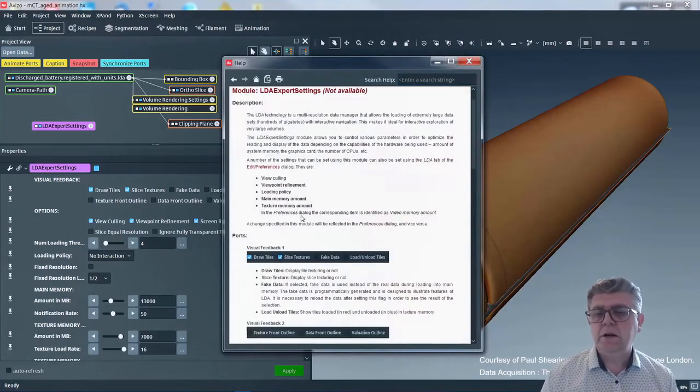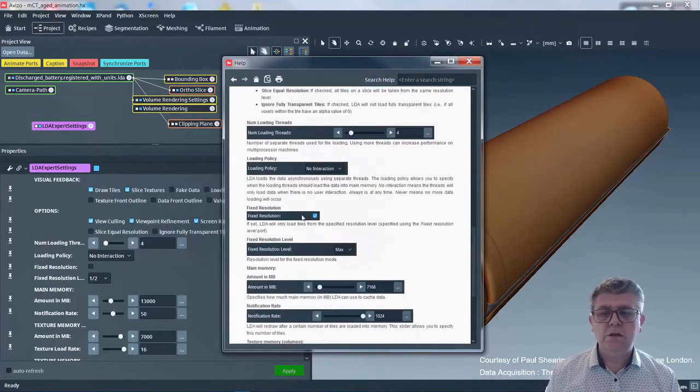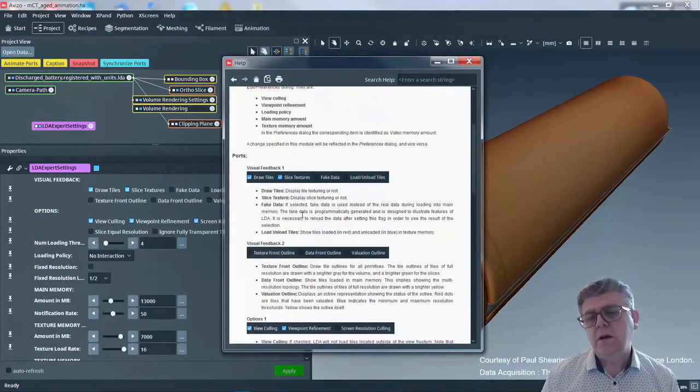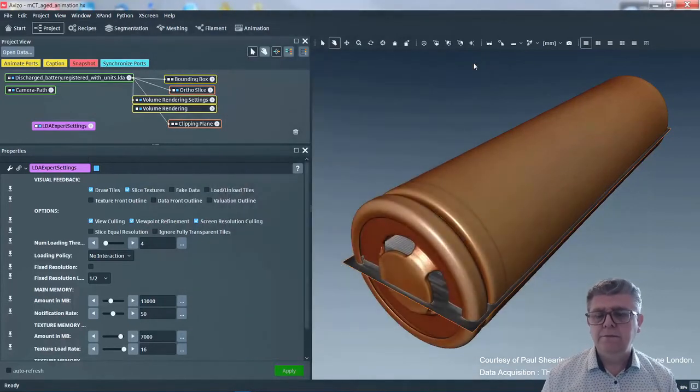And this is explained. So even if the module is a little bit hidden because it's not in the menus, if you activate it through the TCL console, then you can get the help. Okay. So let's move on.